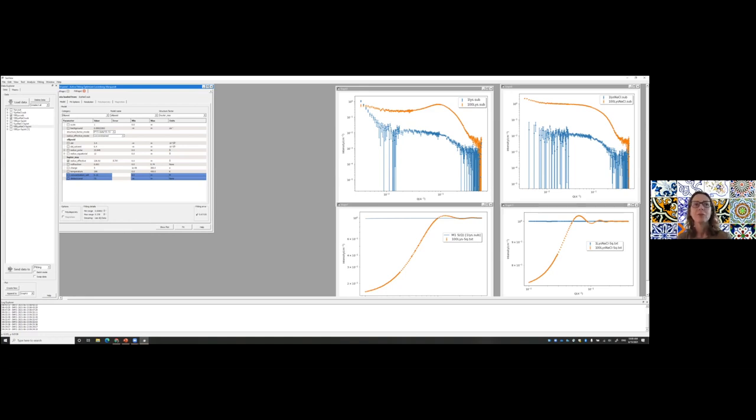Then if you just want to do a very rough simulation, you can try to calculate the profile without any further calculations. If you want to do a proper simulation, you have to let the structure relax because you're using a structure from a different technique. Say if it was EM, for example, it's probably cryocooled, you know, it was blocked at a surface. So you want to do a slight simulation to relax the structure to what you would expect for a solution. And that you can do, Crysol will do it, SASSIE will do it as well. So you do need to do a little bit of simulation work.